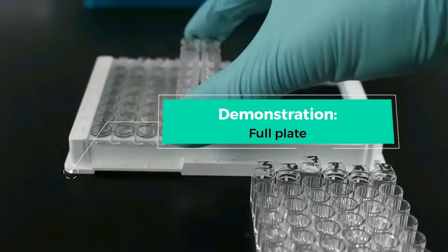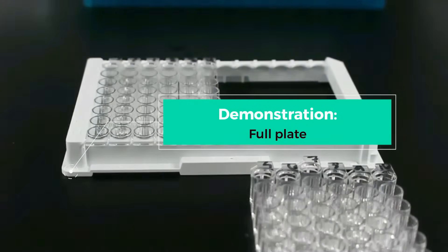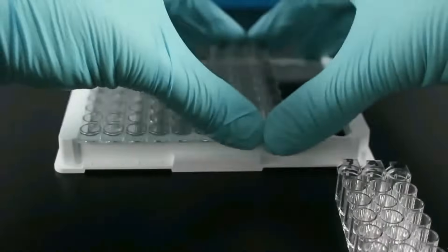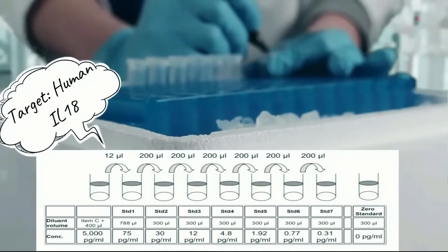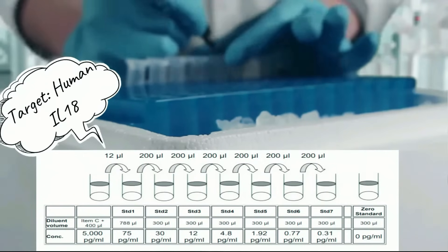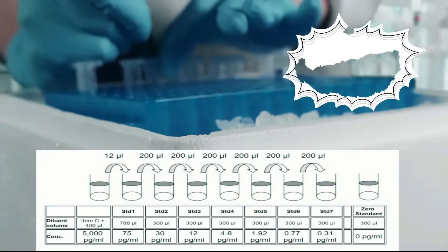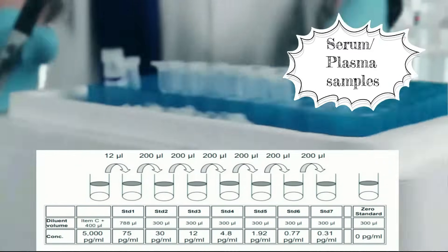For demonstration purposes, we are going to show a full plate. For human IL-18, we constitute the standard at 5000 pg per ml. We will then dilute the sample so the top concentration is 75 pg per ml. Next, carry out a 2.5 dilution all the way until standard 7, so the bottom concentration is 0.31 pg per ml. We will also include a zero or blank as a control.